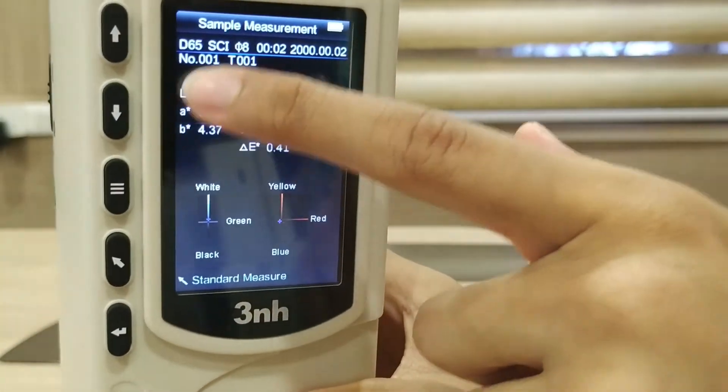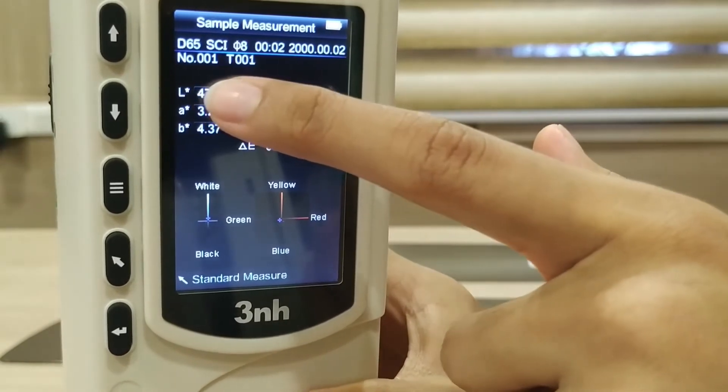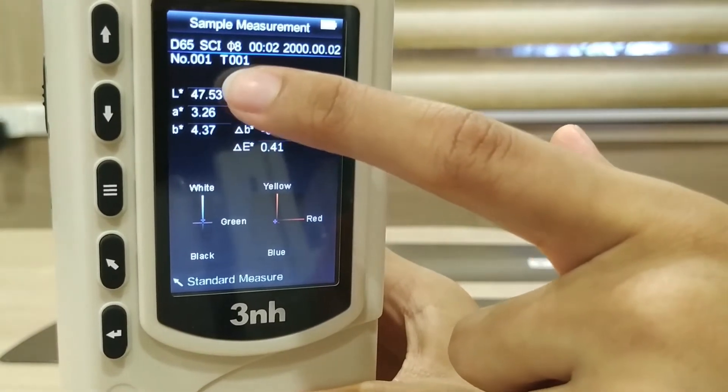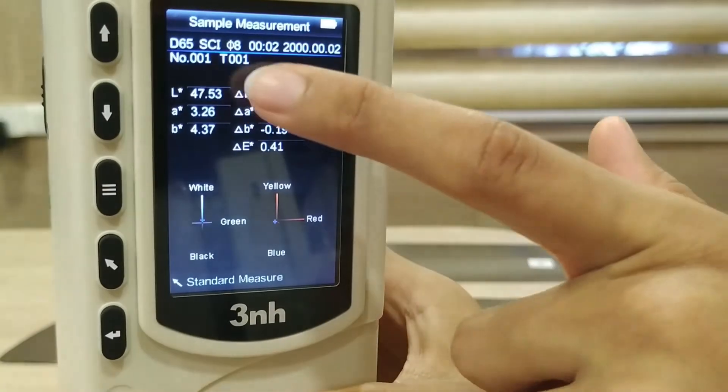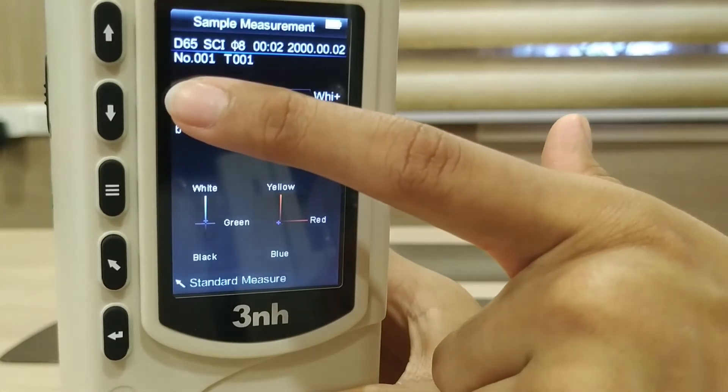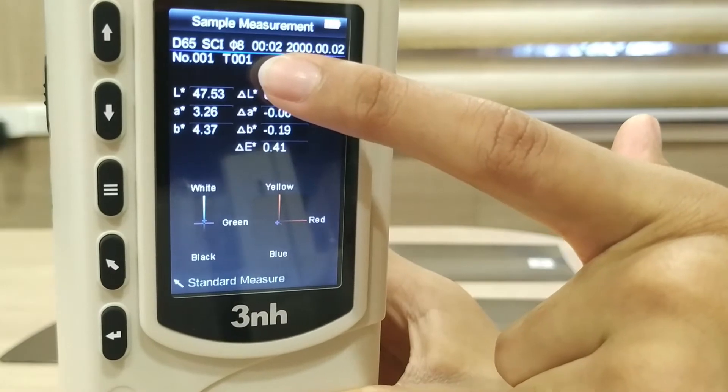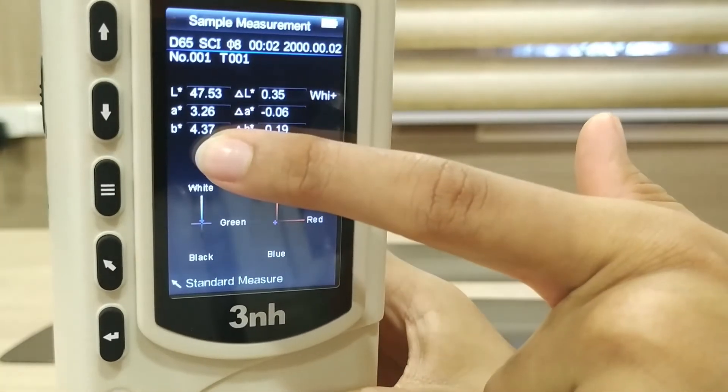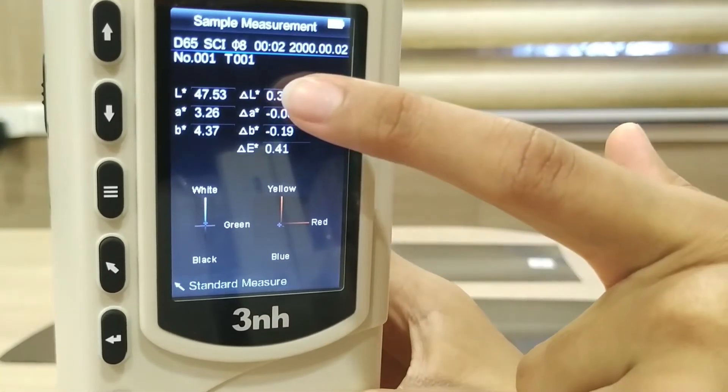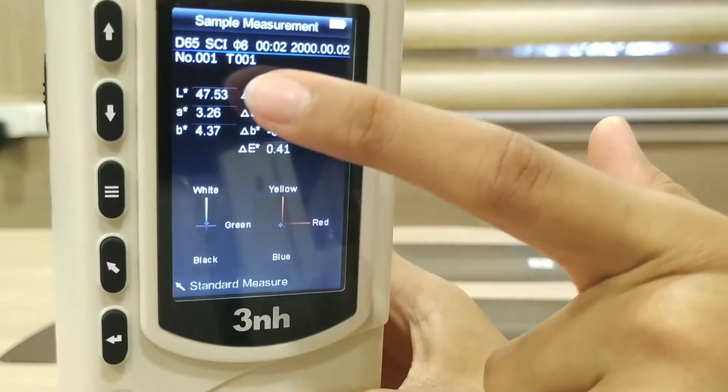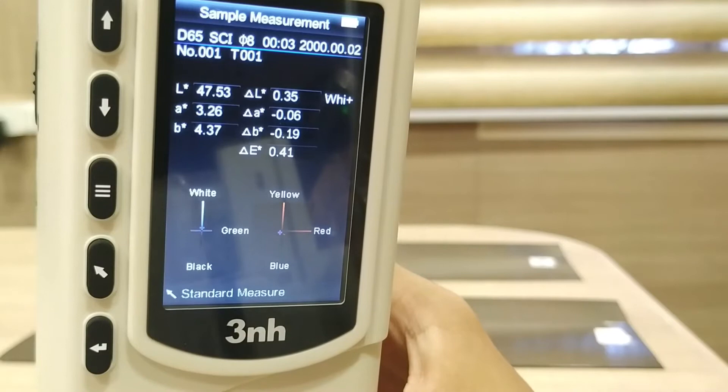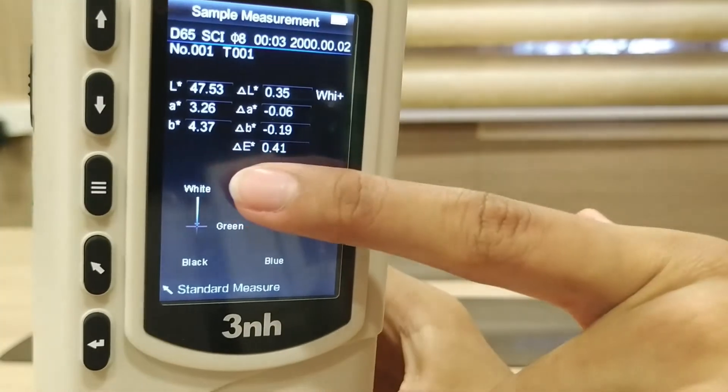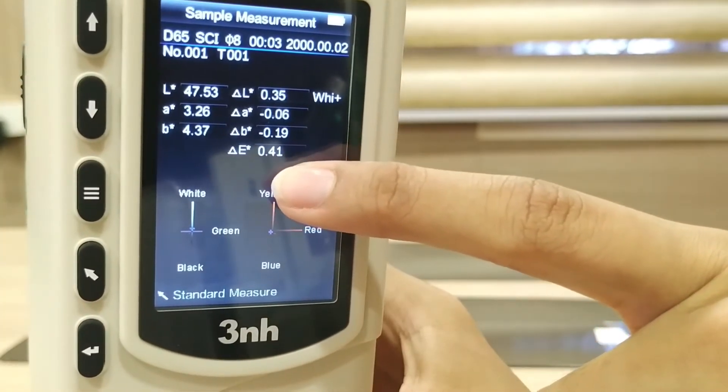Number 001 indicates sample number 1, and as I mentioned earlier, T001 indicates standard 1. So this is the first sample for the first standard. Here are the LAB values of our sample, and the delta values represent the difference between the sample and the standard. We look at the delta E value which is 0.41 in this case.